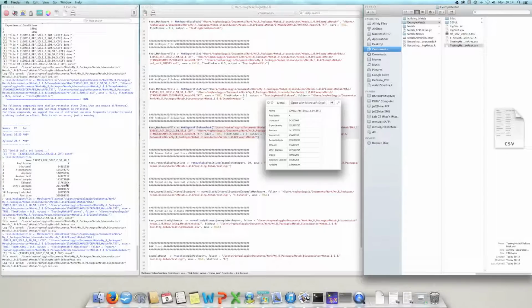So the only difference between this value calculated by MDIS and the one that we calculated, again, is that we guarantee that we are comparing exactly the same reference ion mass fragment across conditions, while MDIS may use different ion mass fragments according to the sample. So that's the main difference. In this case, for instance, it's clear that it's using exactly the same ion mass fragment because the values are pretty similar.